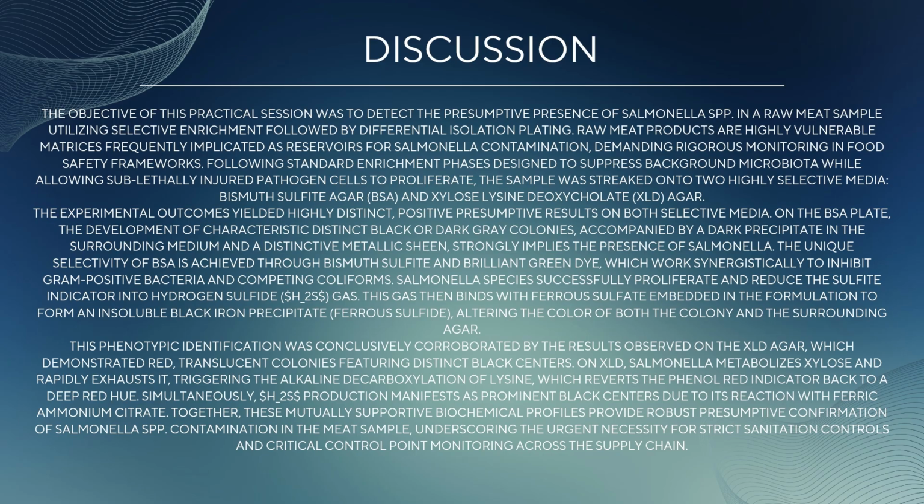Together, these mutually supportive biochemical profiles provided a robust presumptive confirmation of Salmonella spp. contamination in the meat sample, underscoring the urgent necessity for strict sanitization controls and critical control point monitoring across the supply chain.